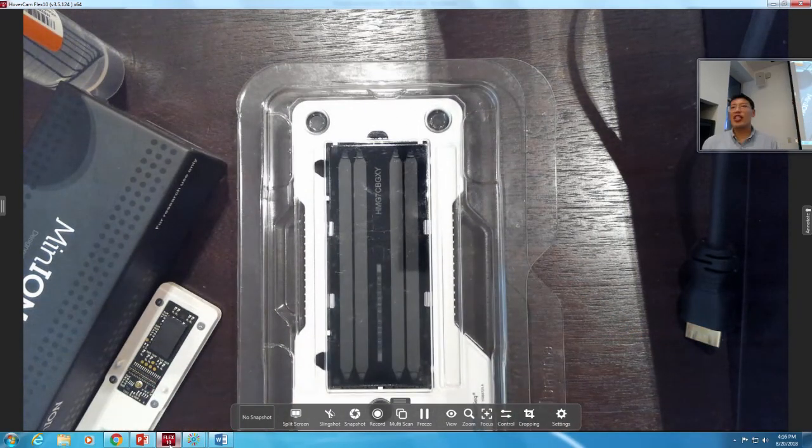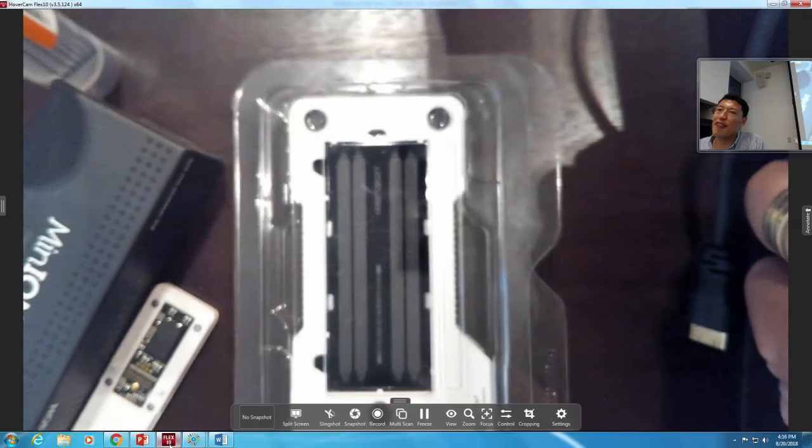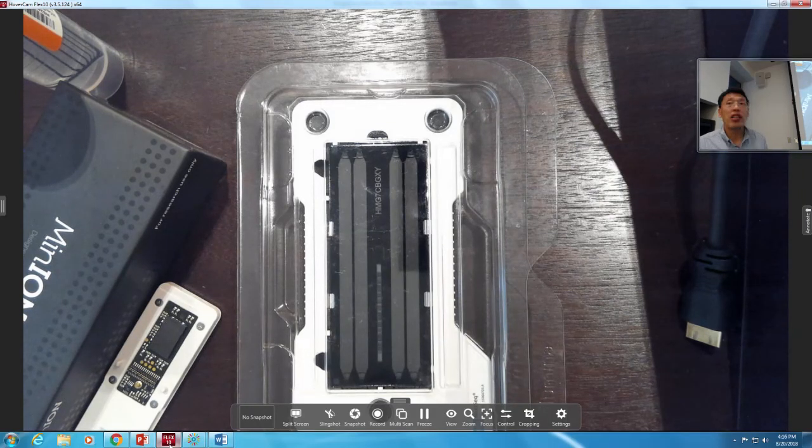But you see that this is the flat surface, and this sequencer is a two-color sequencer, and it's a combination of different aspects of Illumina sequencing technology. So these are four different lanes. Actually, this is one lane, and they are connected, so it's not considered as independent experimental units. And this will give you about 400 million reads in that instrument run.